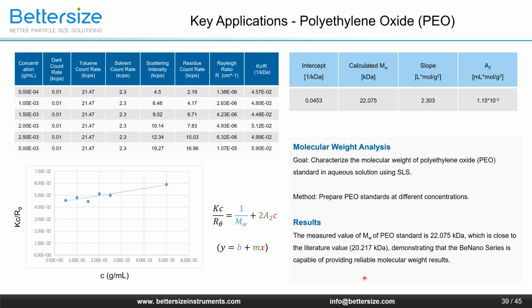In this application, SLS was used to characterize the molecular weight of a polyethylene oxide standard dissolved in water. PEO aqueous solutions were prepared at different concentrations and then filtrated. The scattering intensity of PEO solutions was detected at various concentrations. The Debye plot is then constructed by plotting and linearly fitting these values versus the concentration profiles of the suspensions.